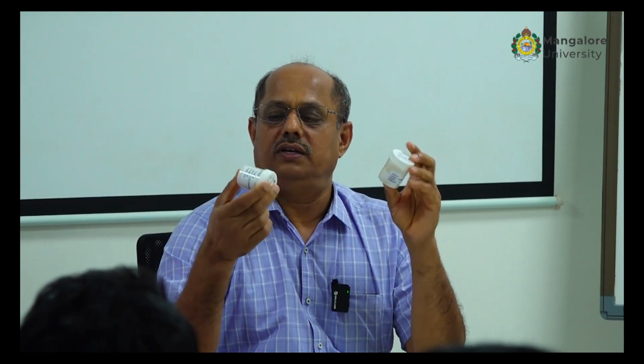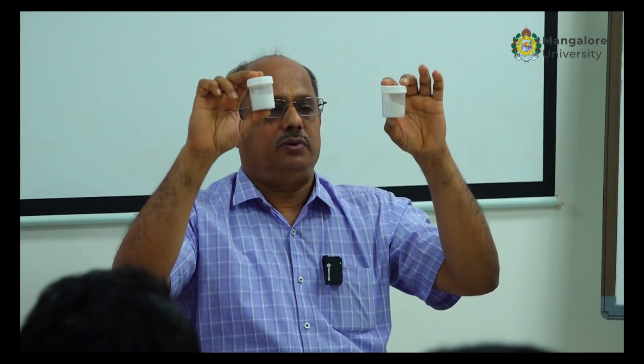And you take the other one and evaluate the activity. We have another set for small geometry, thorium and uranium. So we have been talking about different types of geometries. You can see that we use reference material in various geometries. Spectra are available for these also. You can recall this from the computer, and if you wish, you can calculate.